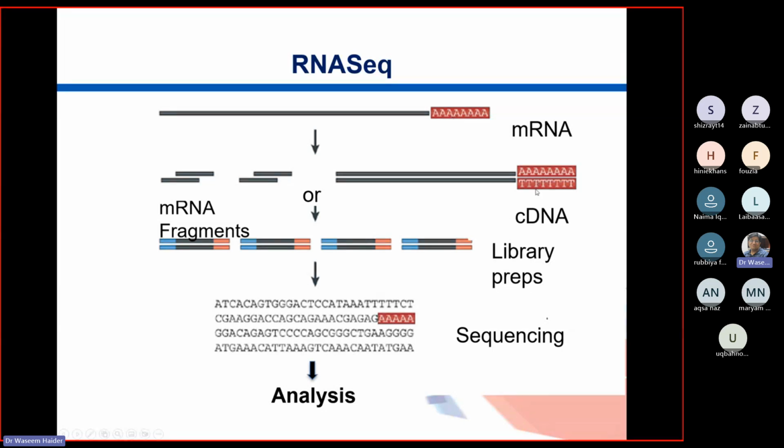So this poly A is then converted into oligo dTs, and then this second copy, or this DNA copy, is formed, because here you don't see U's but you see T's. Here you see A's, so that is actually part of RNA, and this is for sure DNA, not RNA. If it would have been RNA, there should have been runs of U's, uracils.